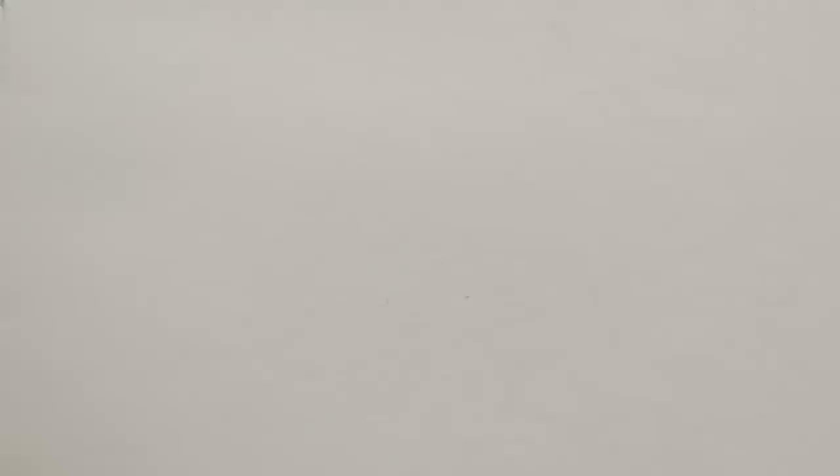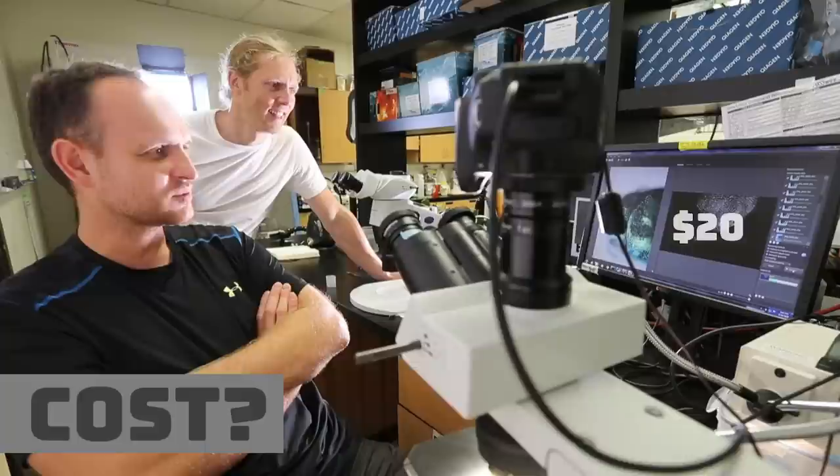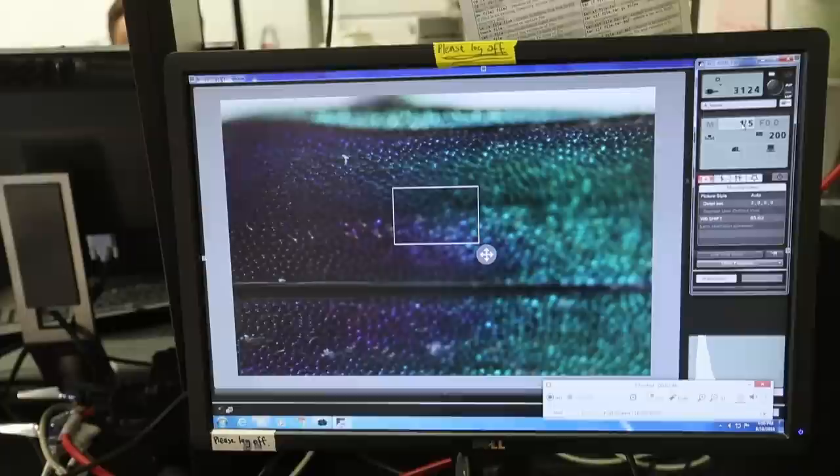To explain this, we've broken down their technique into five components, which we'll go through one at a time. And like all the techniques we teach in 52 Things, our estimate of time in this one is two hours, although they can do each insect in about 30 minutes. The cost, if you have a microscope and a DSLR, is only about $20 for the stitching program, and about $100 or so for the connector to the DSLR.